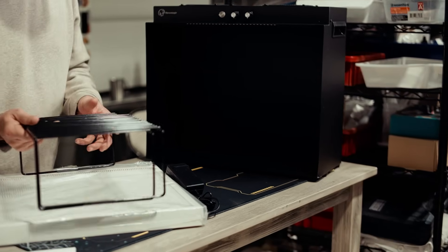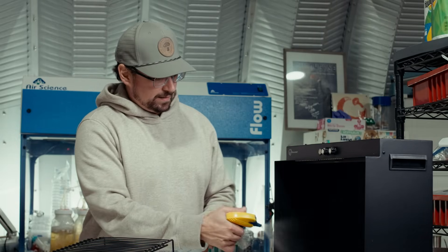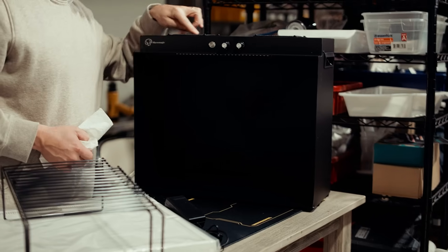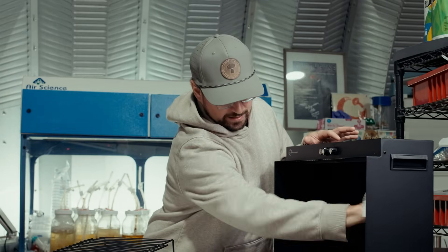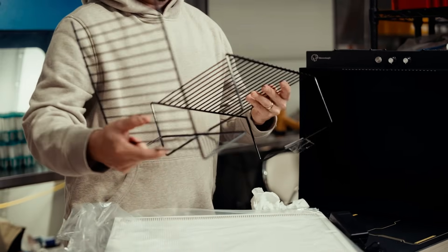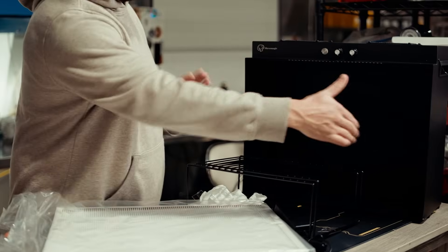It came with stands for your workspace and what looks like the power cord. Looking inside, it looks really clean. I'm going to spray it out with isopropyl since it just came from shipping. My first impression is that it has two different intake fans with a mesh filter, which is good. The directions say to put it on medium, not low or high, to help calibrate the speed. It came with grates to use as a working surface, elevated off the table for full airflow, and it also came with an instruction booklet.